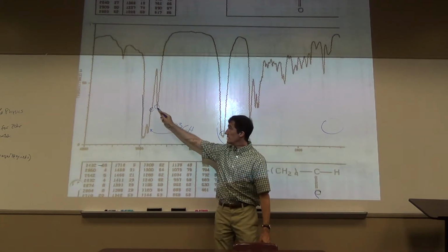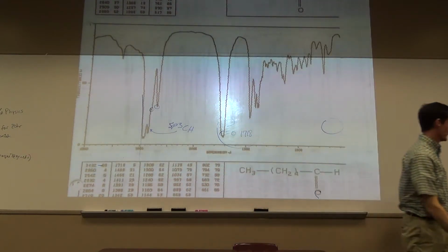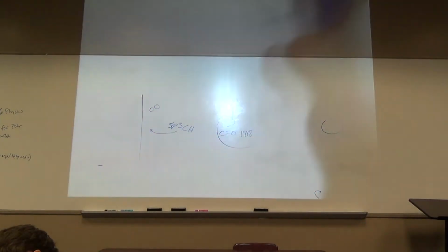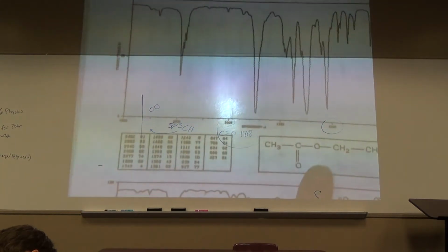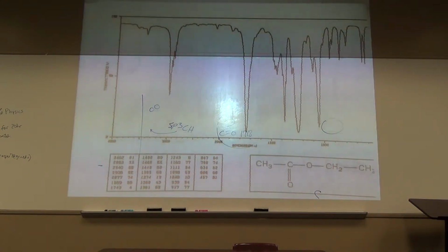You guys tend to always forget this CH peaks here. Always. What's next functional group? What is this here? Ester.